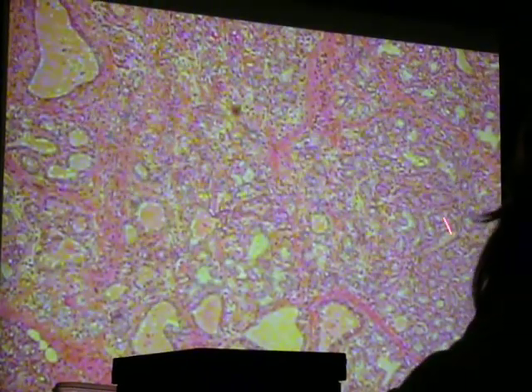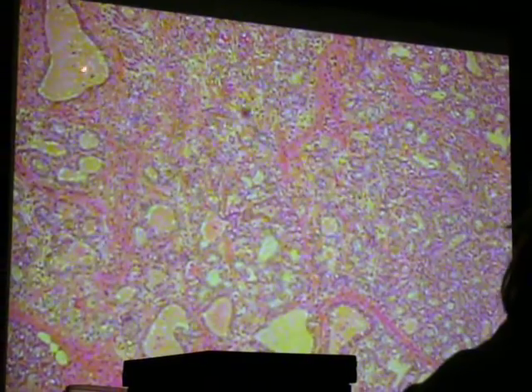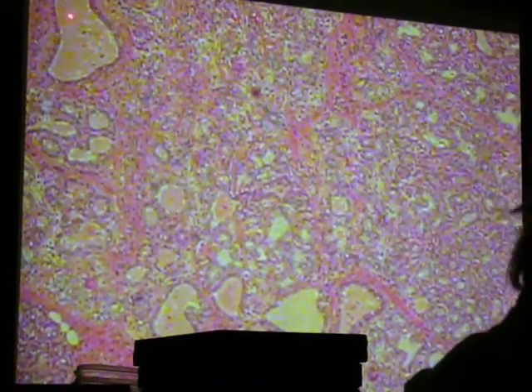Glands, these are all the glands in here. Right here, it's probably milk secretion, milk product here, plugging in that lactiferous duct.